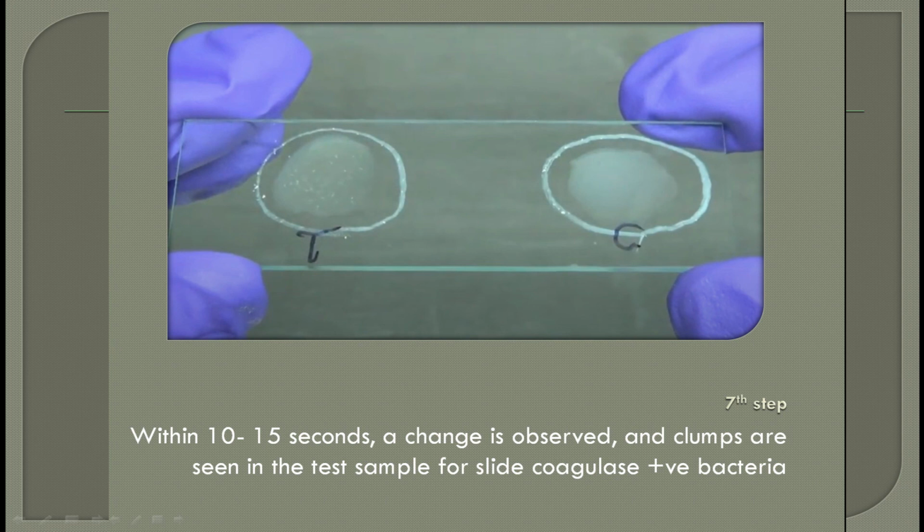Okay. Conversely, when we talk about the examples of these bacteria which give these tests positive, we will also be able to deduce what kind of bacteria. So now can you understand why this is a very important diagnostic test? We can see whether this is a staphylococcal bacteria or not. Even then we will also be able to distinguish between different staphylococcal bacteria. How so? When we talk about the examples of each of these, who gives tube coagulase positive, who gives slide coagulase positive, we will talk about it there. Okay. So I hope the procedure is crystal clear.